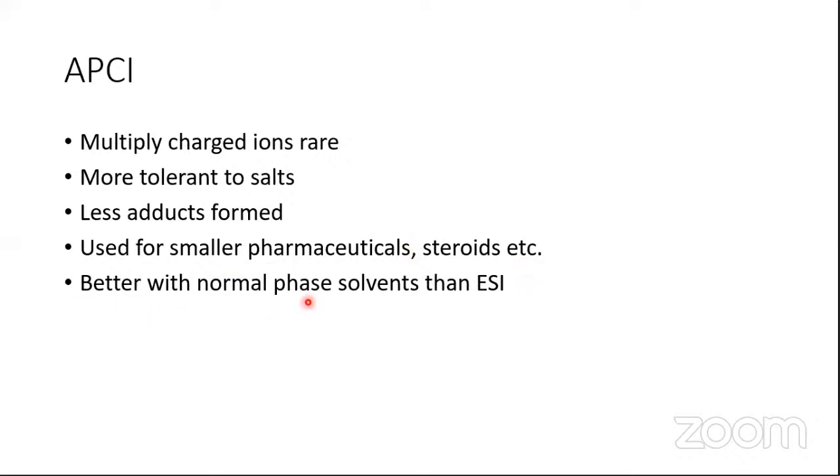It is better with normal phase solvents than ESI. With ESI, you always require reverse phase chromatography, so highly polar solvents. This being used for semi-polar compounds, you can tolerate some solvents like isopropyl alcohol, etc.